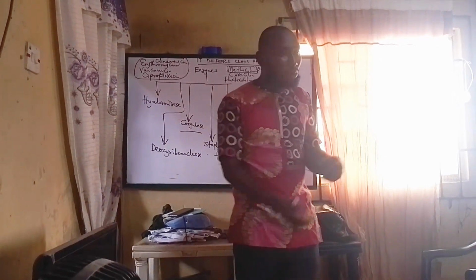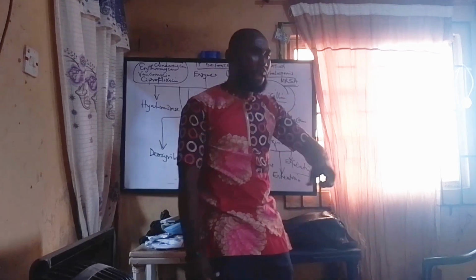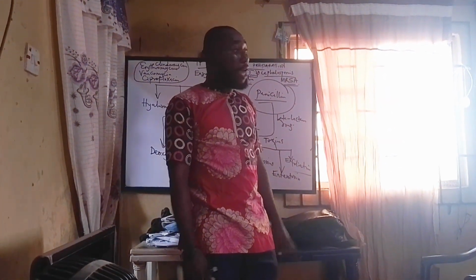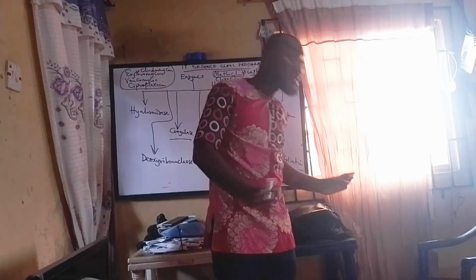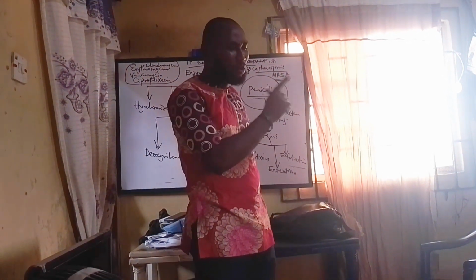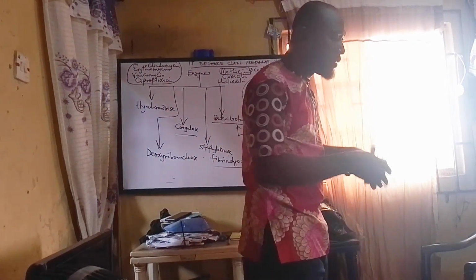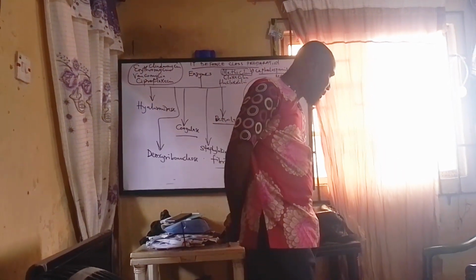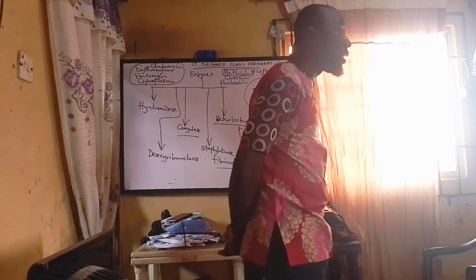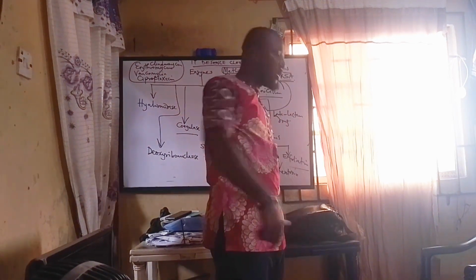And when there's staph, what will happen? It will make the blood to form a what? A clot. Using the enzyme coagulase. If you say this thing, they'll give you no stress. On a short note, they'll give it because this person works. But if you just stop at culture, saying we saw staphylococcus inside the infectious disease, they will ask, who told you that thing you saw is staphylococcus? Do you have any evidence to prove it? That's when I'm doing the biochemical test.